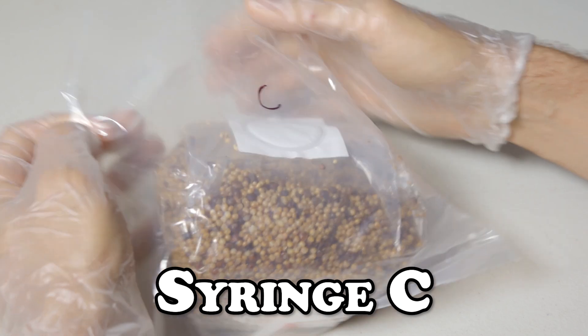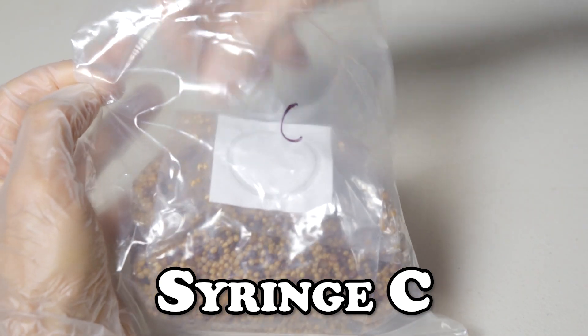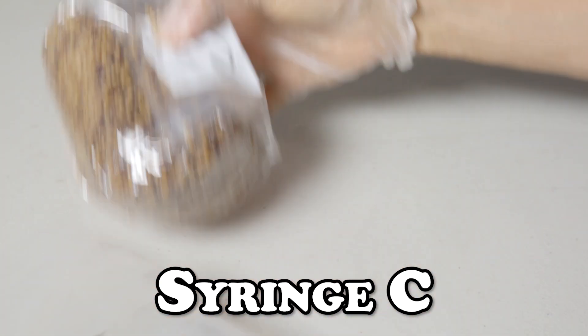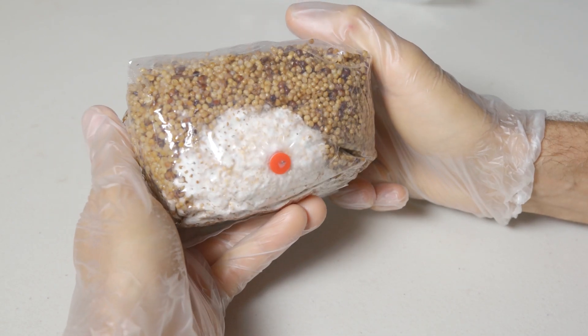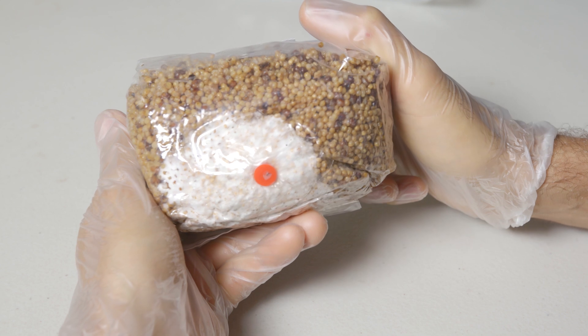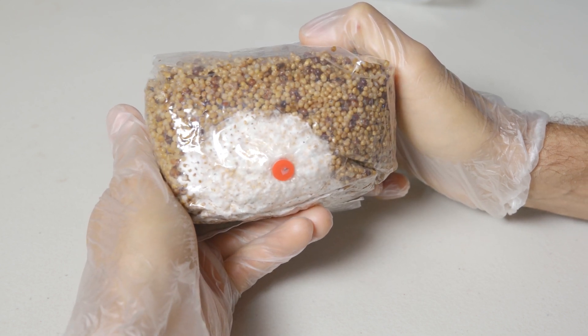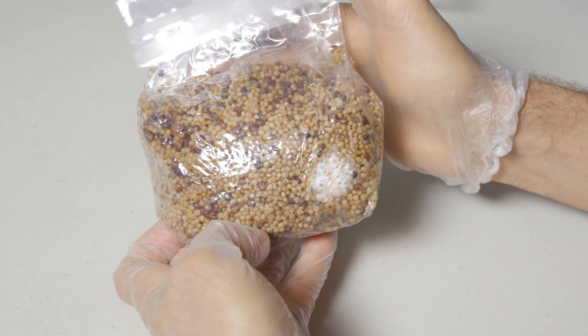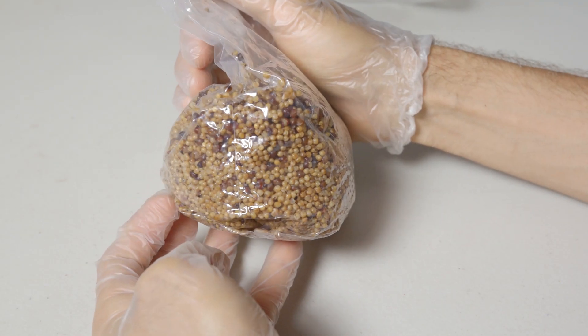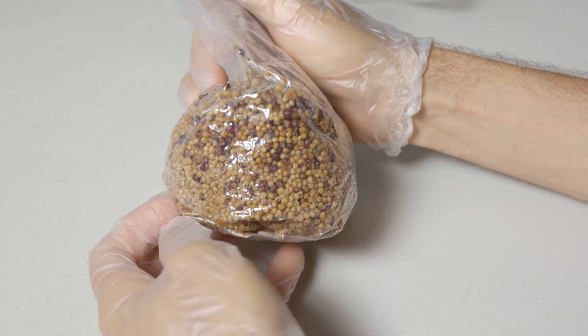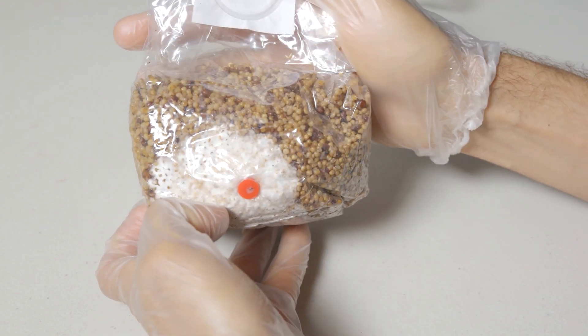Lastly we have bag C. Upon initial inspection we do have some mycelium growing here by the inoculation port. We don't have any evidence of degradation. This bag will continue colonizing effectively. Now we don't want to use antibiotics in grain applications, so a better method would be to start off with a clean syringe in the first place. That way we can avoid antibiotics altogether. This is done through the use of agar.